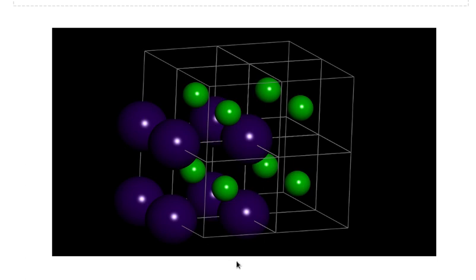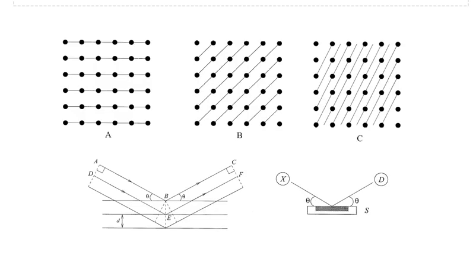Okay. So with these packing types, I've got over here, this is lithium chloride going on and on for many unit cells, and you'll notice that as I rotate lithium chloride very gently, you'll see that planes appear and disappear as I move it around. Every now and again you'll see some different planes appear, and these are the planes that the X-rays will be reflected off, and from these reflections from these planes we'll be able to determine what the packing type is.